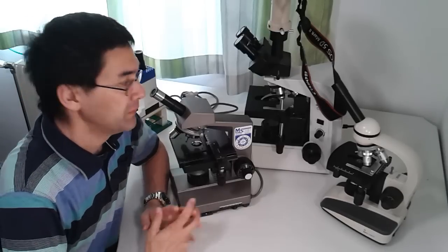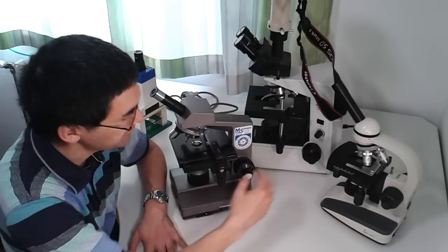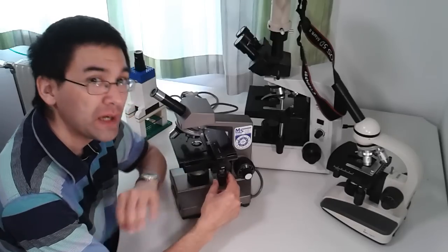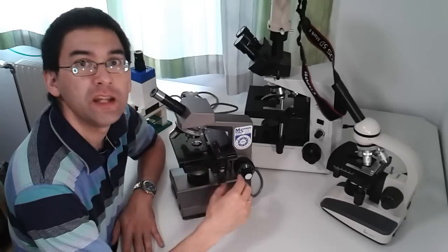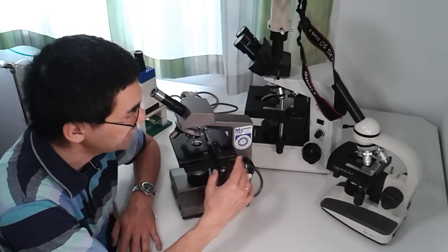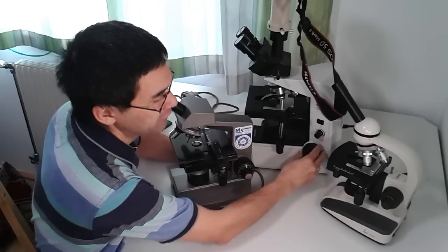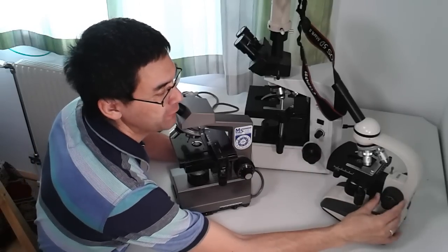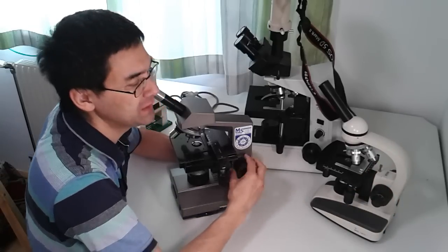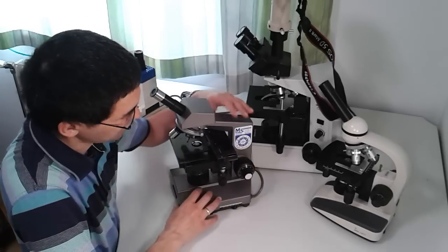Now I want to show you how these three microscopes are similar. First, all three have a mechanical stage where you can move the slide in X and Y positions — very practical. Very low-cost microscopes only have stage clips, so this is significantly more convenient. Second, they all have both a coarse and fine focus knob, either combined in one system or as two separate knobs.